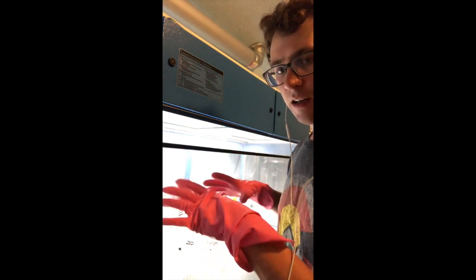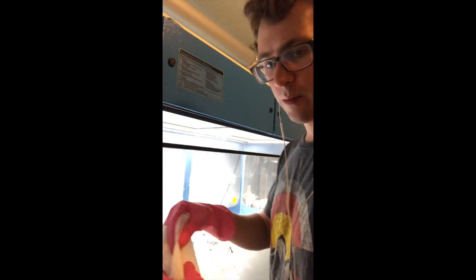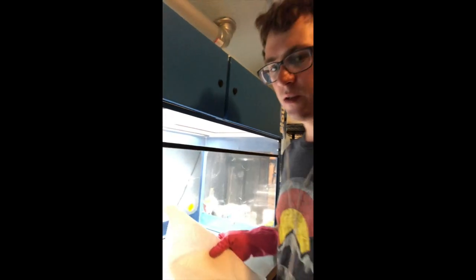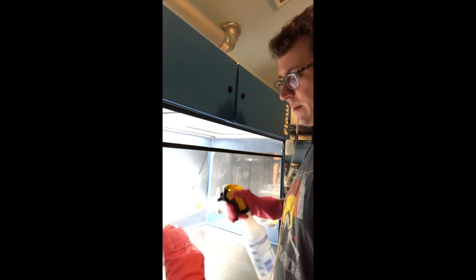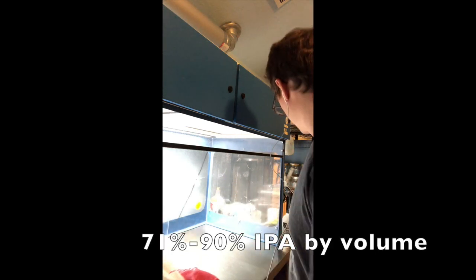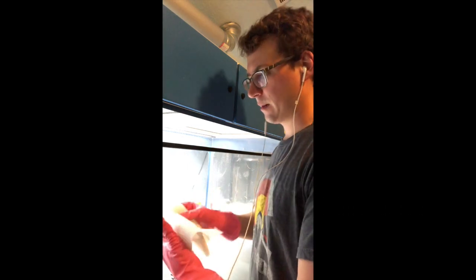Alright, so now that these plates have dried from the bleach spray, I'm just gonna go ahead and start wiping the bleach with an alcohol wipe. I usually just grab a couple paper towels and coat them with alcohol. I like to use isopropyl of about 71%, or up to 85, even 90% isopropyl will work, but this is mainly to get the bleach off.